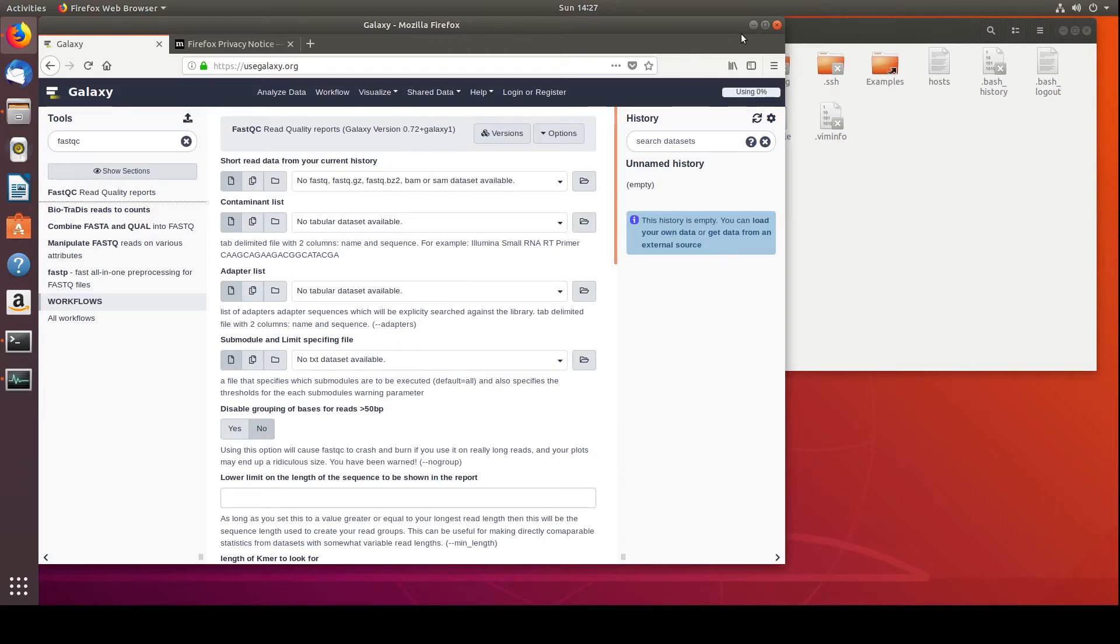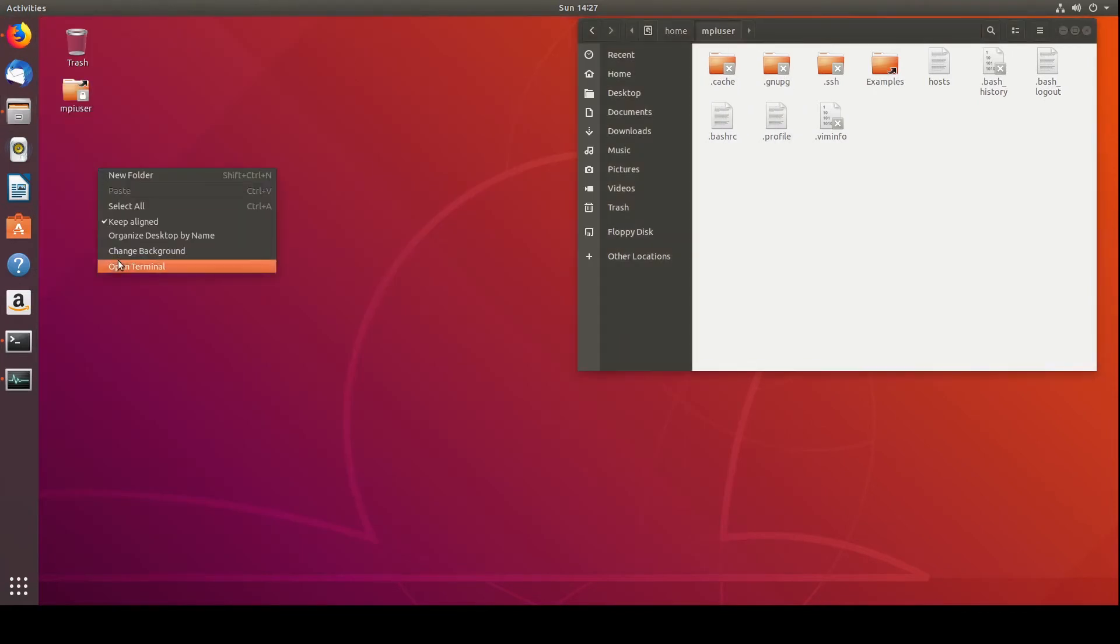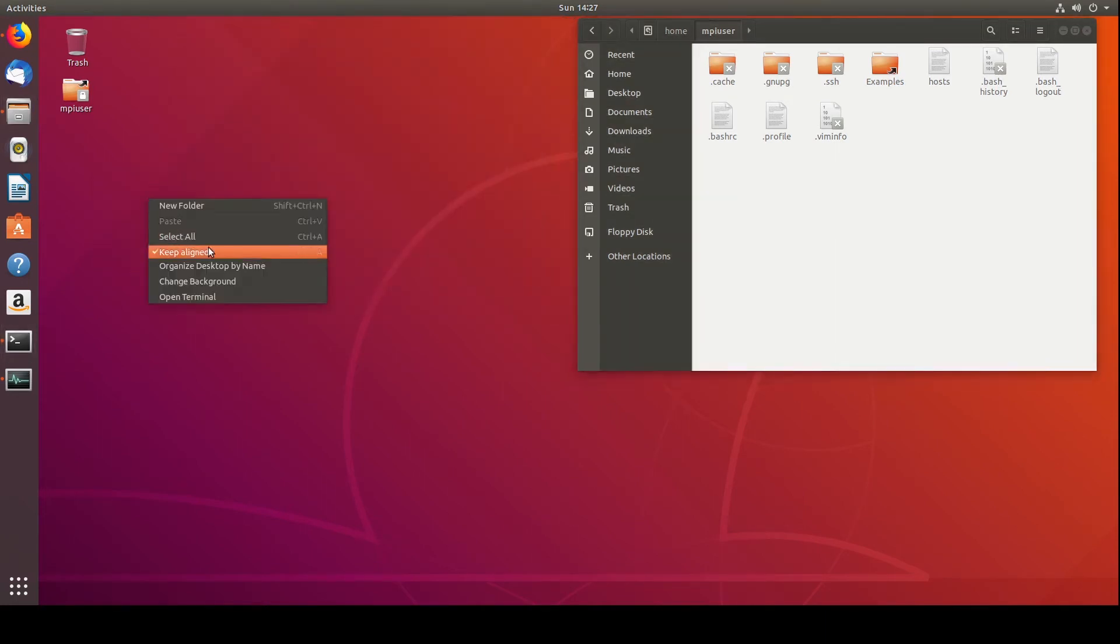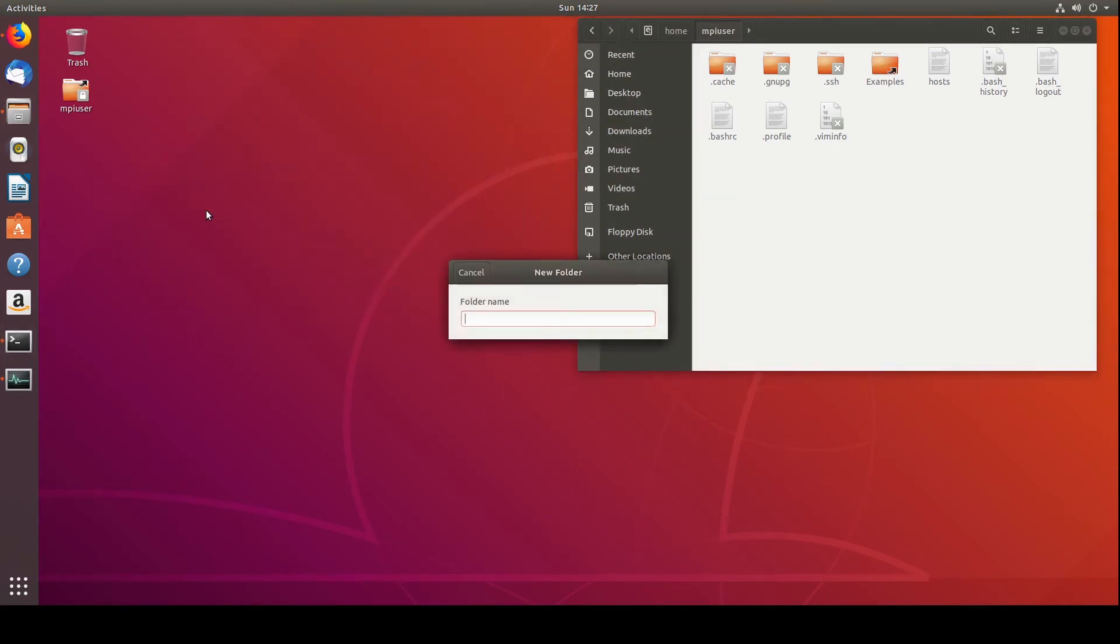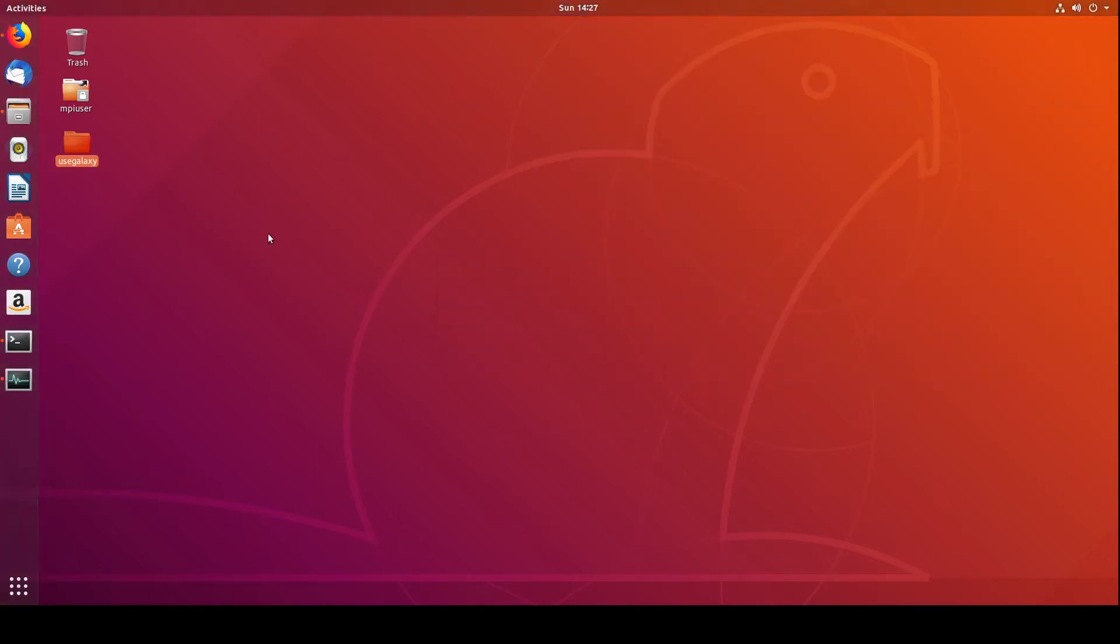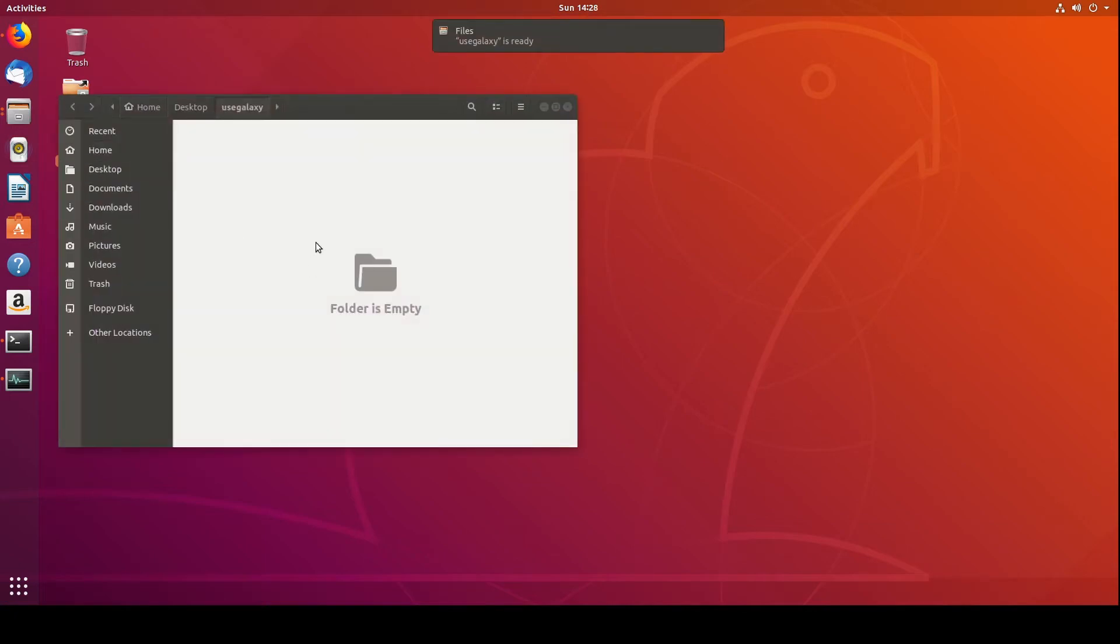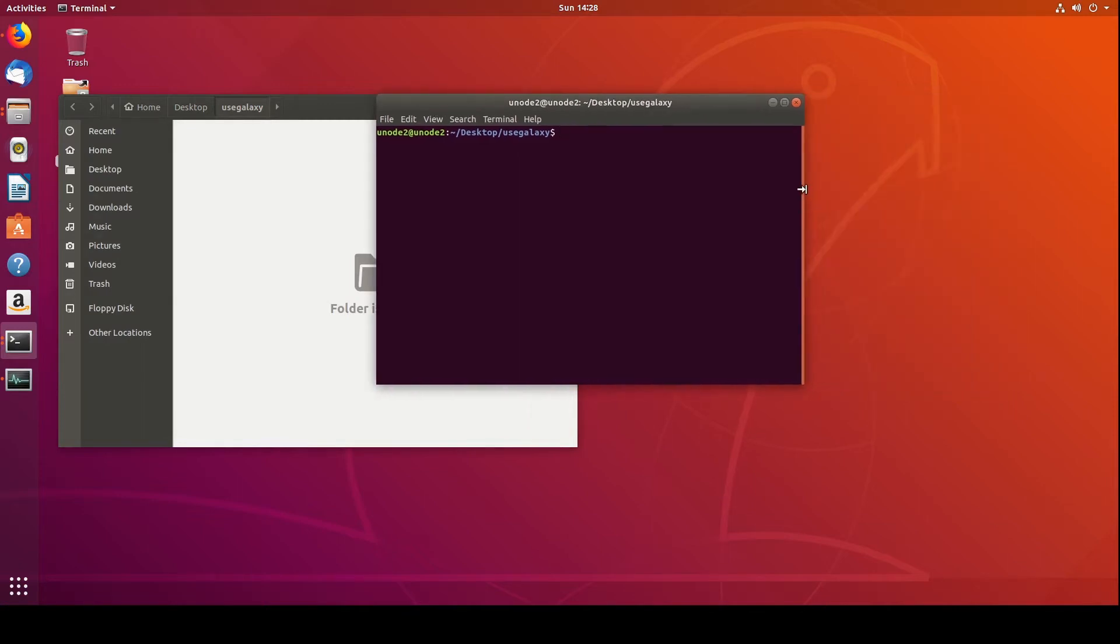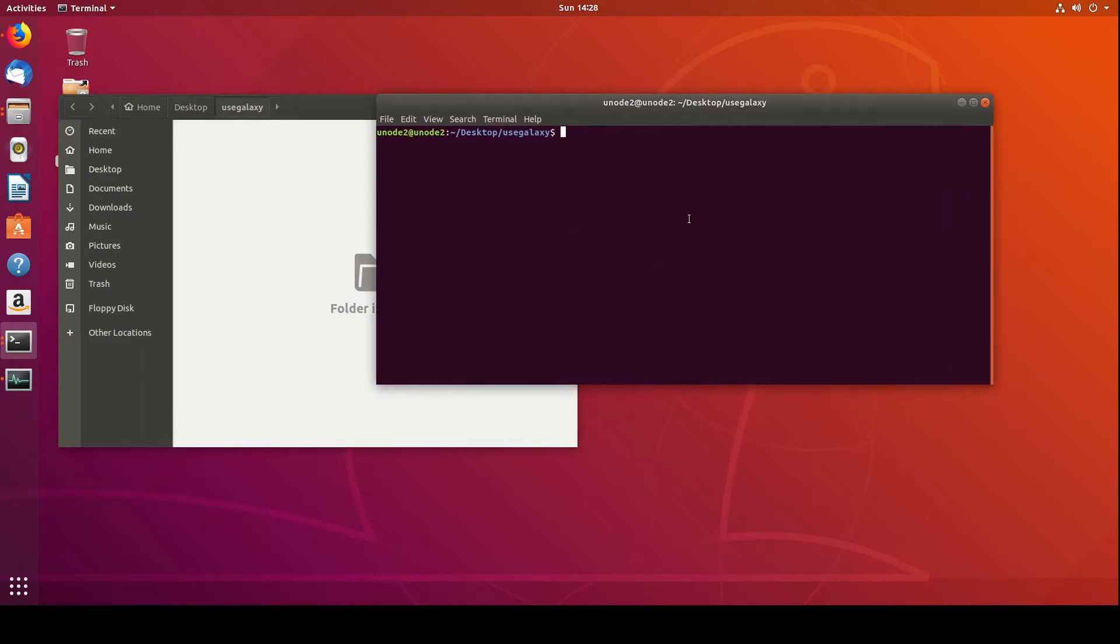So the first thing that we're going to do to get this installed is we're going to create another folder. We'll create another folder, new folder, and we'll just call it UseGalaxy for now. This is just going to be a place where we're going to download all of the information that we're going to install from to get that going. So we'll go into it. We'll right-click, open in terminal, and then what we're going to want to do is we're going to want to clone the GitHub repository. And for this, we'll run it first.